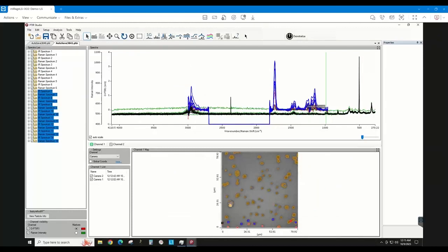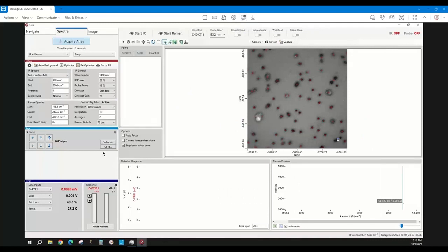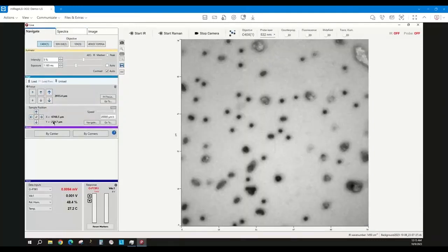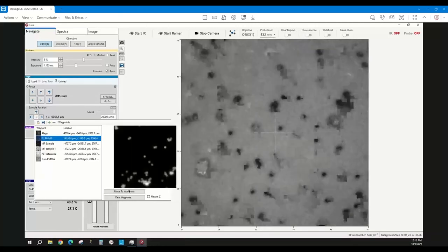Right, so that was our relatively easy 1 micron, and I say that because you would have never imagined a 1 micron experiment to be quite easy. The other sample, I'm just conscious of time. The other sample I want to show you here is, what do we got? I don't think I'll show you the algae sample. The fluorescently labeled PMMA bead, I think, is a good one.